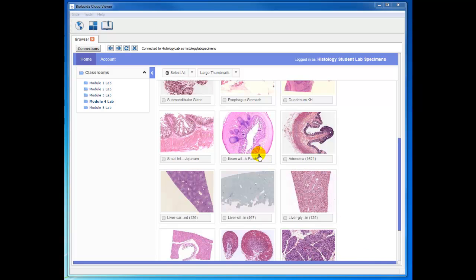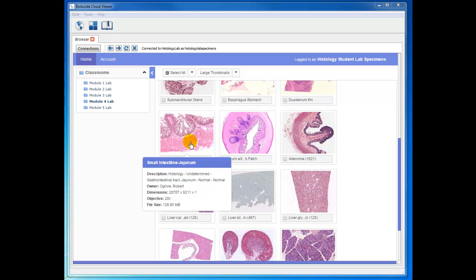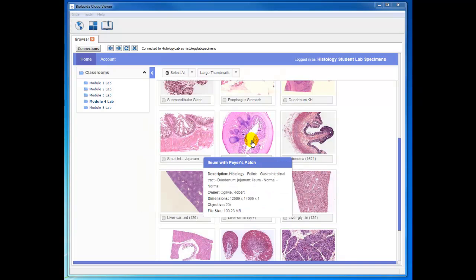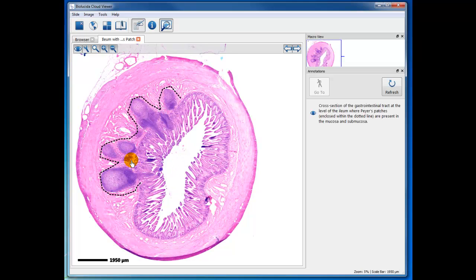This is going to be a recording to contrast the jejunum with the ileum. Remember that we do not require you to differentiate between the ileum and the jejunum, except that in the ileum we want you to recognize the Peyer's patches, because both of them have villi, both of them have intestinal glands, but these unusual collections of lymphatic nodules in a patch, that, while you can't really tell it here, is on the opposite side of where the mesentery attaches, is very typical of the ileum.